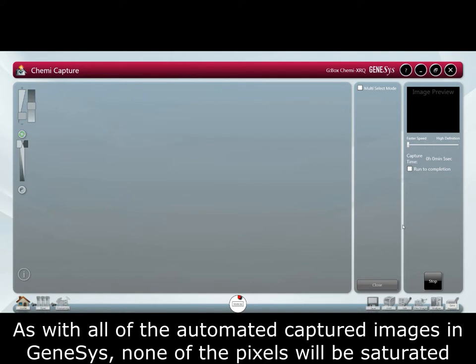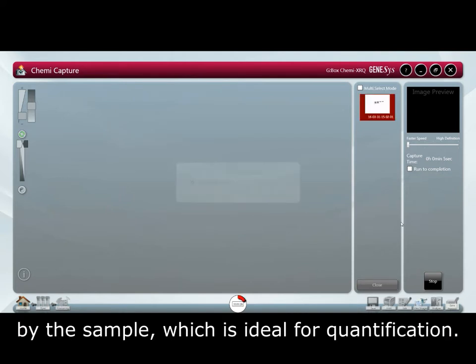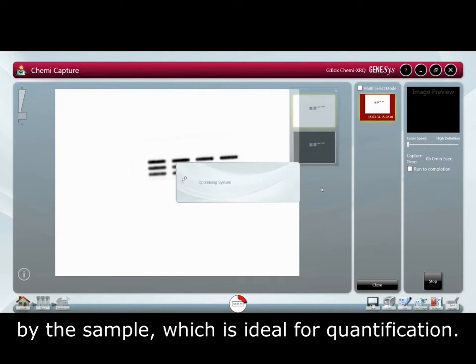As with all automated captured images in Genesis none of the pixels will be saturated by the sample which is ideal for quantification.